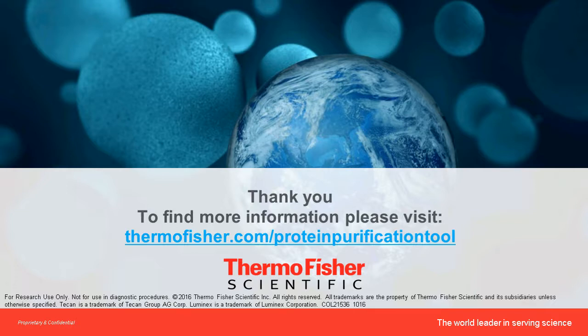If you work with a core lab, I strongly suggest that you talk to the core lab before you start the experiment to make sure that you have the correct samples prepared, and then you can schedule your analysis at the appropriate time.